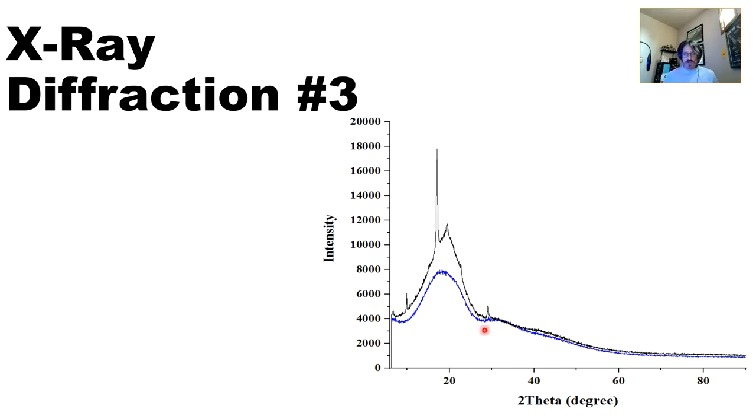So we have two spectra here. We have this blue line and this black line, and there are two different conditions. This blue line is amorphous. When you see a big hump like this on an X-ray diffraction spectra, that means there's some amorphicity, if it's very, very wide. When you see these peaks here, and there's actually quite a few, I don't want to get too far into this research because it'll distract from what I'm trying to get to, but we're actually surprised to see this many reflections.